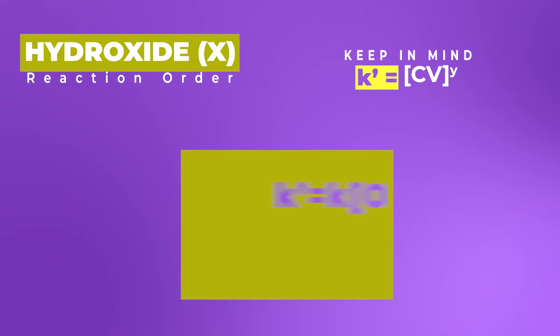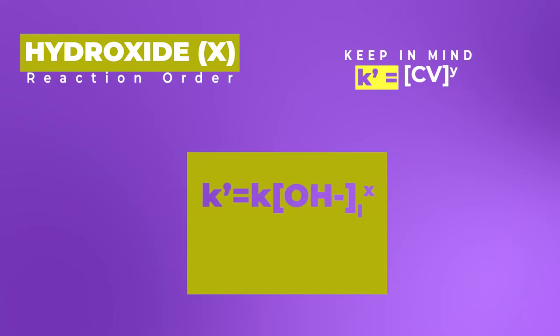So once we've established a reactant order for crystal violet, we need to do the same for the sodium hydroxide or hydroxide concentration. As mentioned before, it's really important to generate these lines from the microlab from the spectrophotometric data. So for the original 0.05 molar sodium hydroxide in solution, this is going to solve for K prime. So the line generated for that experimental section is going to be equal to K prime.